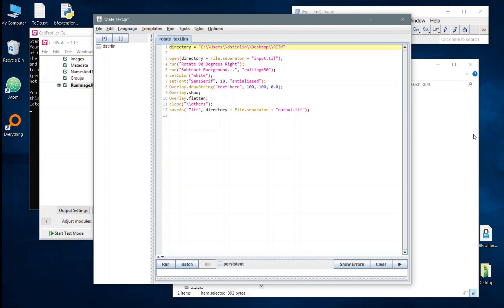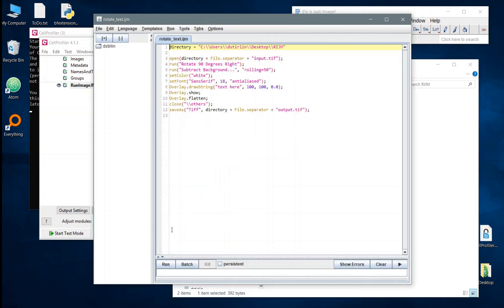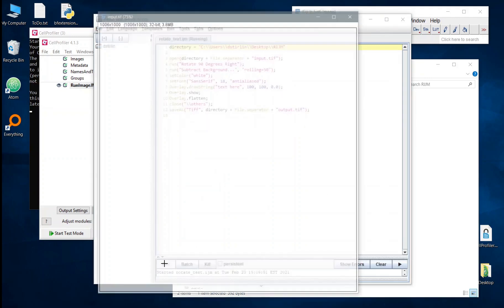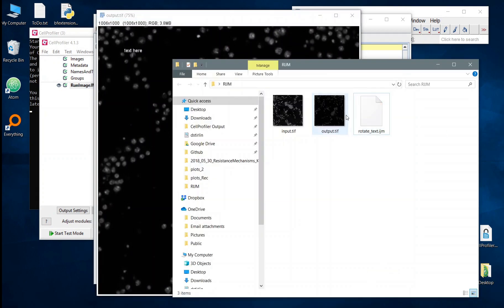So at the moment this is set up to just execute within the folder here that I've made for demonstration. If I were to run this it should hopefully add some text to the image, rotate it a bit and then save it into that folder as output.tif. That is what CellProfiler in a temporary directory will be attempting to load in.